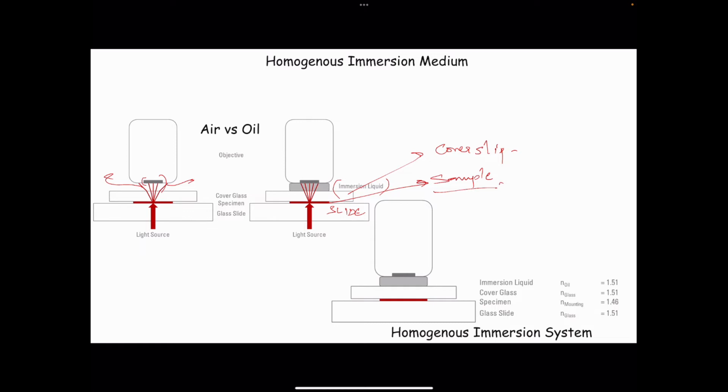Now, if you broadly subdivide these into three main types, the first type would be a living specimen. These living specimens are what you culture in your petri dish. If you want to do an animal cell culture, you culture those cells in the petri dish, right?